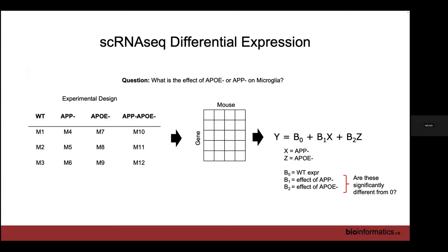So even if you might have had a slightly different definition of T cells had you done it a different way, it doesn't matter. It just matters that the label is the same. So if you have T cell in one data set and CD4 positive T cell in a different data set, you have to figure out for yourself that those are the same and that you want to compare those groups to each other. You just need consistent cell type names across your data.